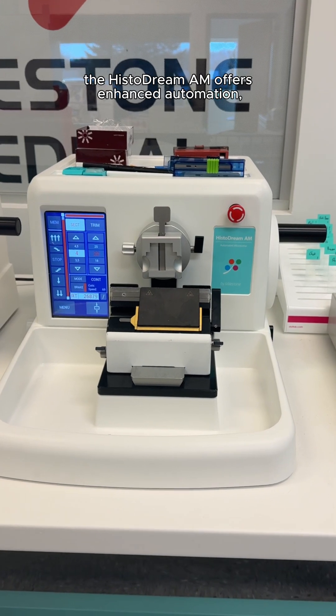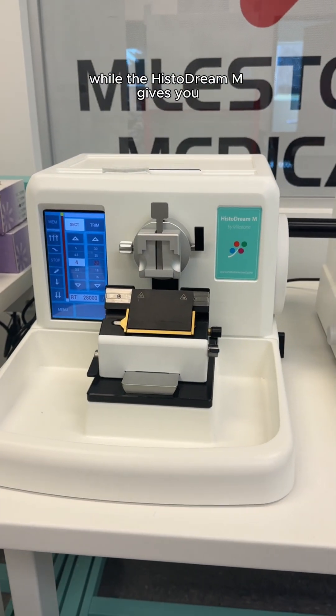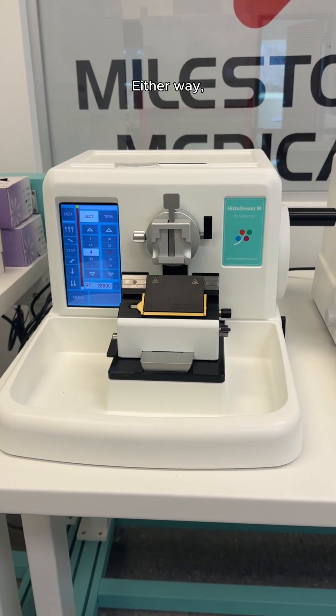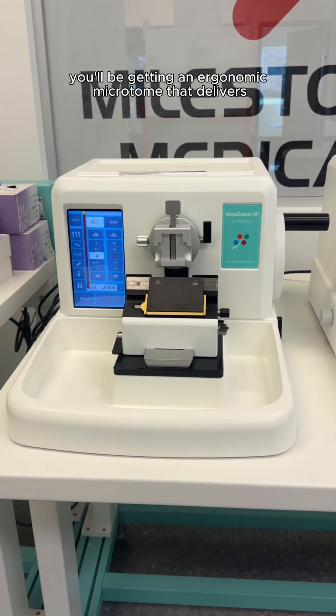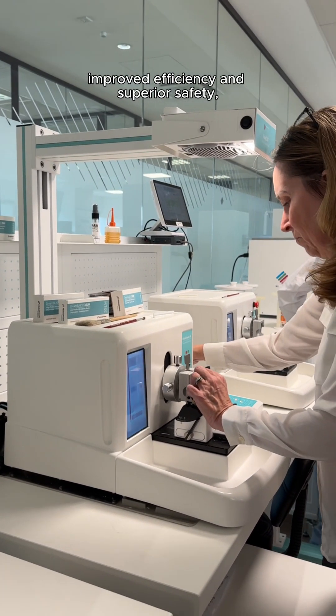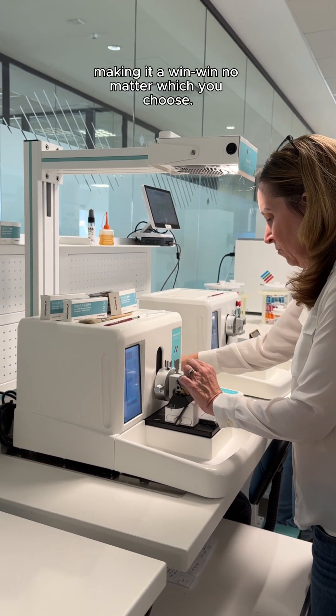In simple terms, the HistoDream AM offers enhanced automation, while the HistoDream M gives you semi-automatic operation with manual flexibility. Either way, you'll be getting an ergonomic microtome that delivers excellent cutting quality, improved efficiency, and superior safety, making it a win-win no matter which you choose.